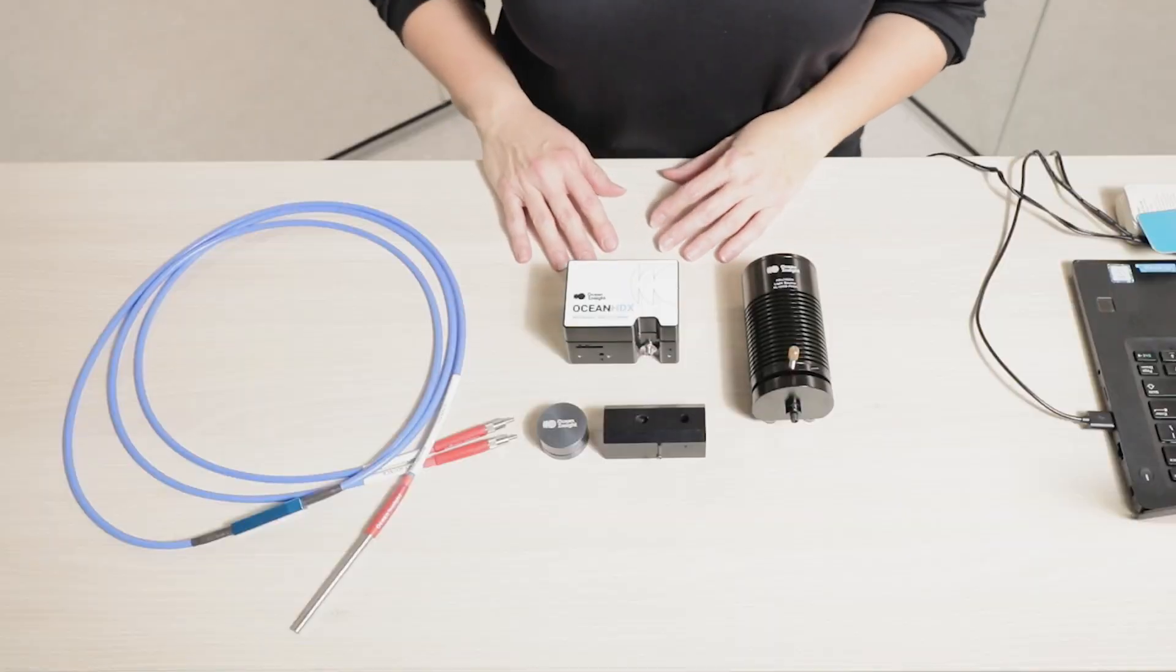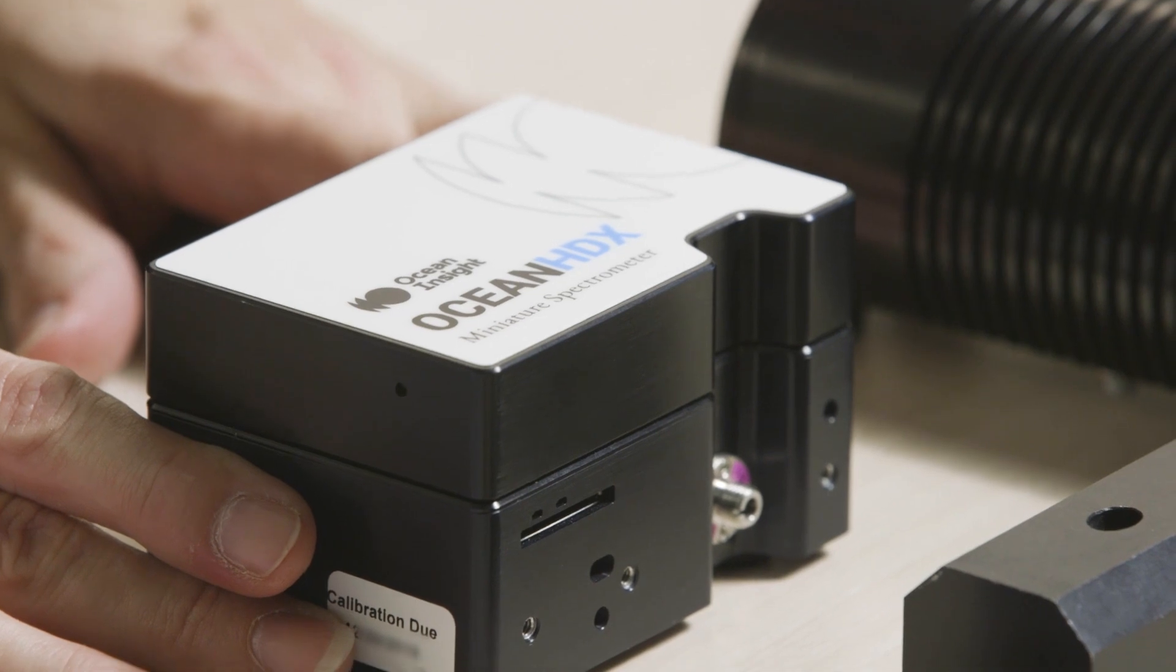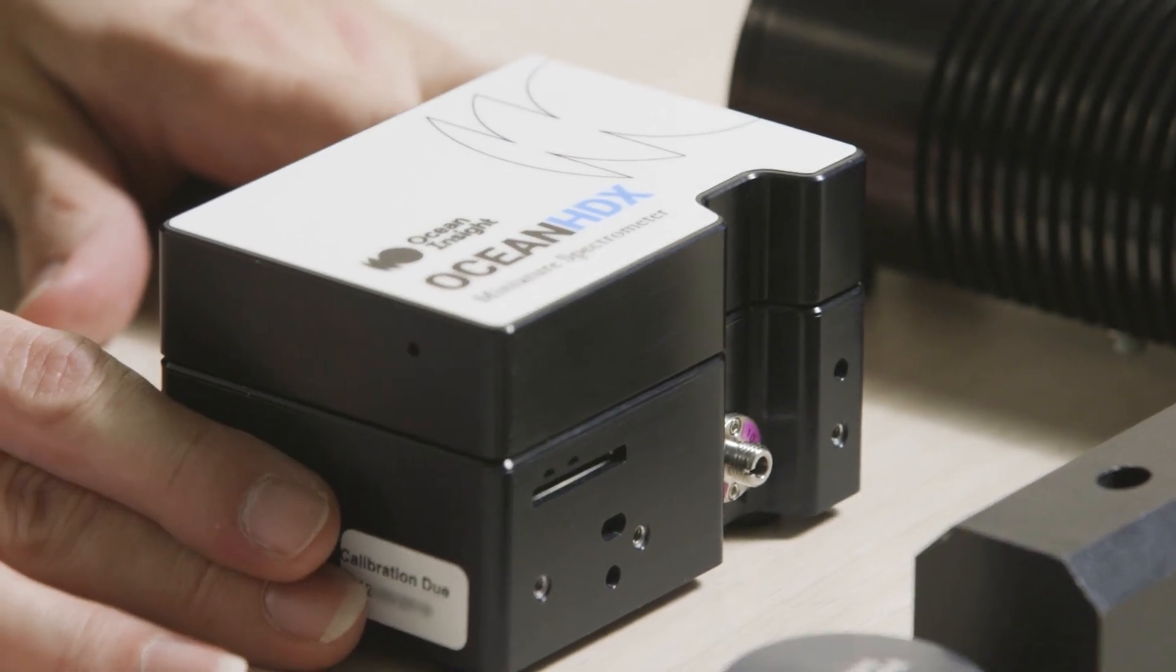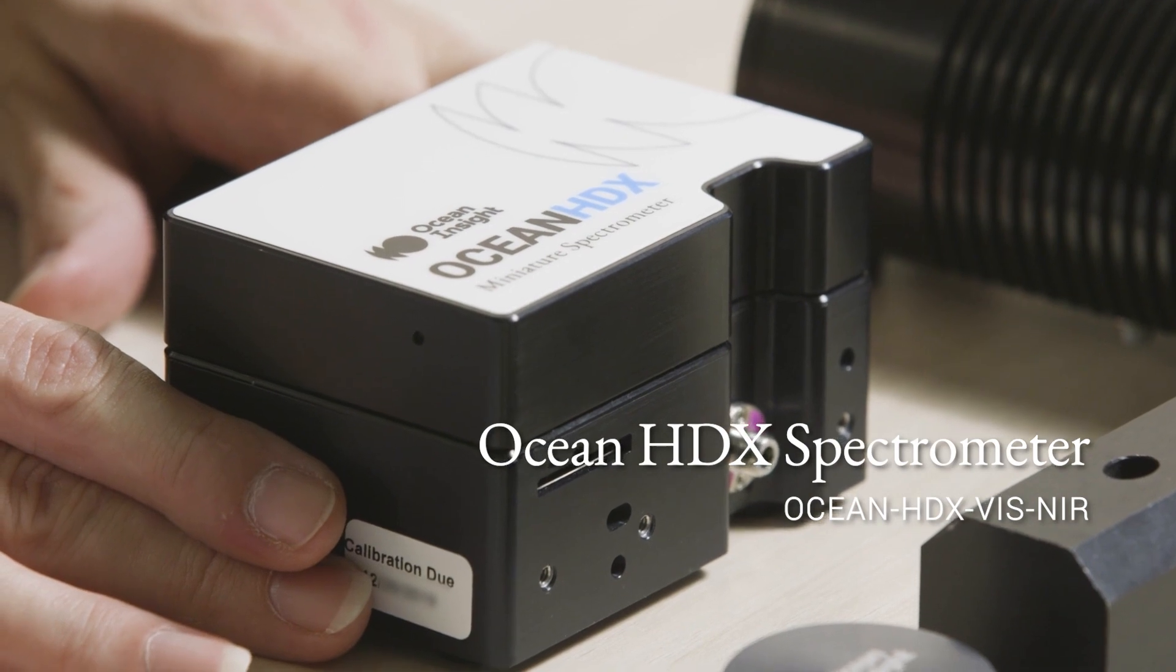The components that we're going to use for our reflectance measurement are our Ocean HDX spectrometer. This one is configured for the visible NIR wavelength region, which is ideal for the color measurement we're going to be making.